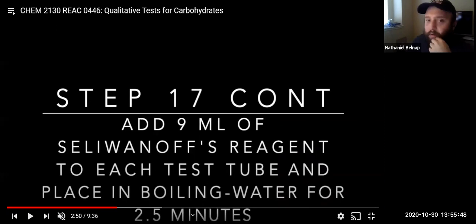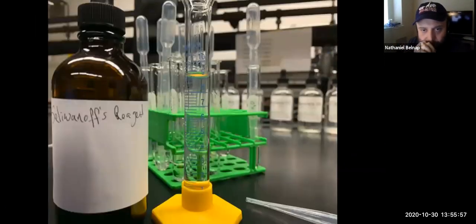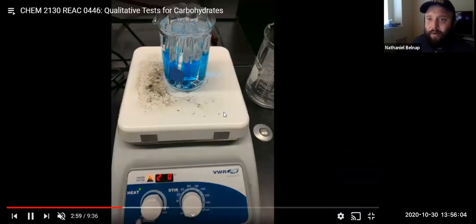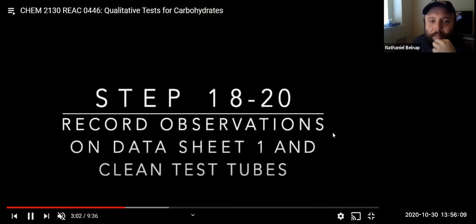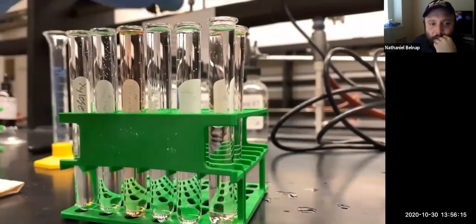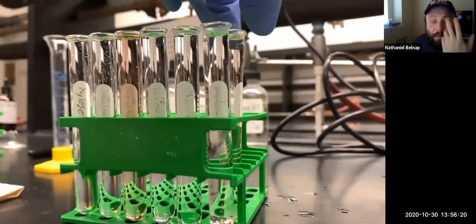So you're going to put 9 mL of Seliwanoff's reagent, 2.5 minutes. It's just kind of weird that this is all done in still motion. You know, it's not like a video of him actually doing it. That's probably why he added the music. Yeah, probably. Wait, I guess here's, oh, now he's actually.